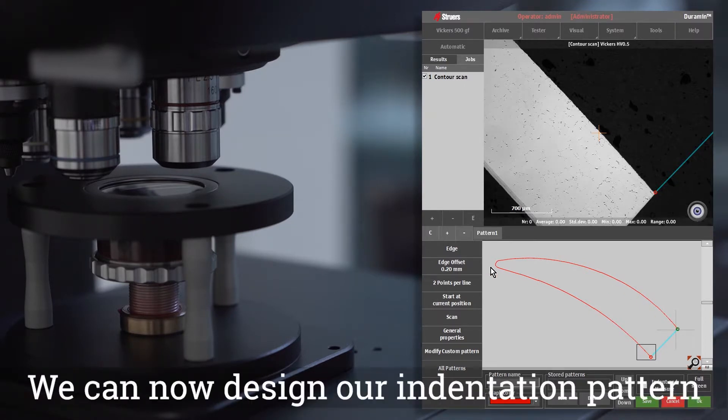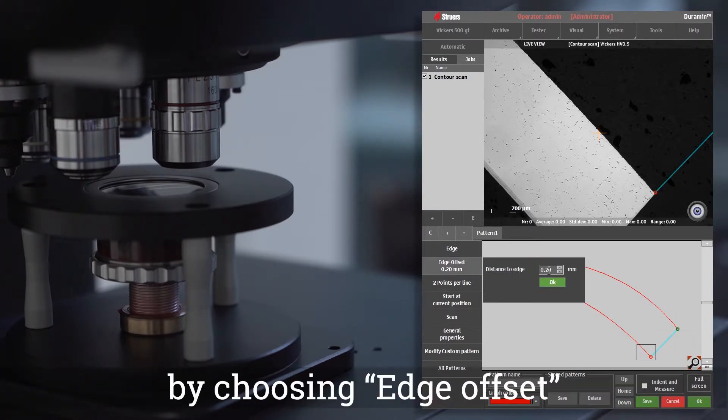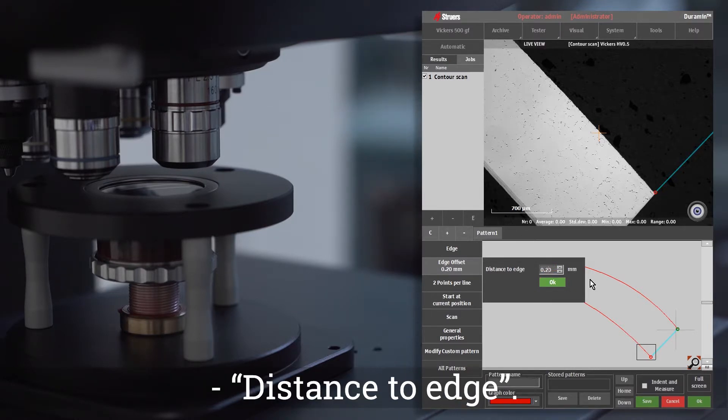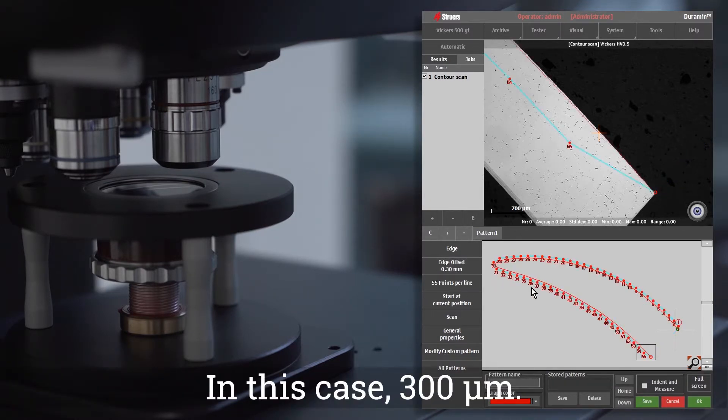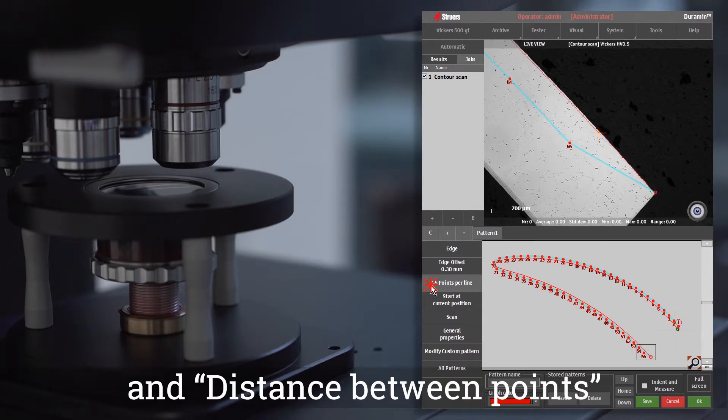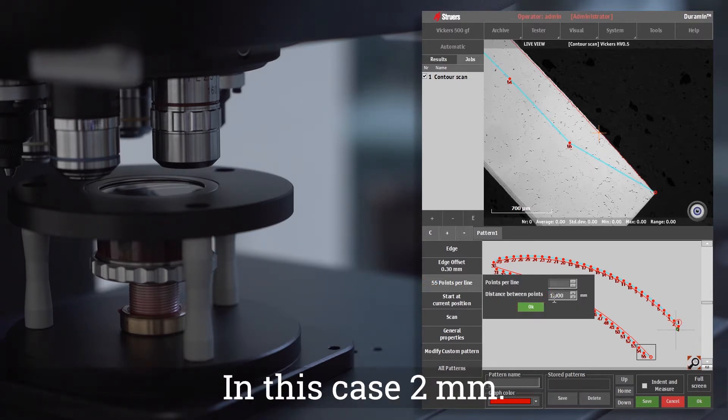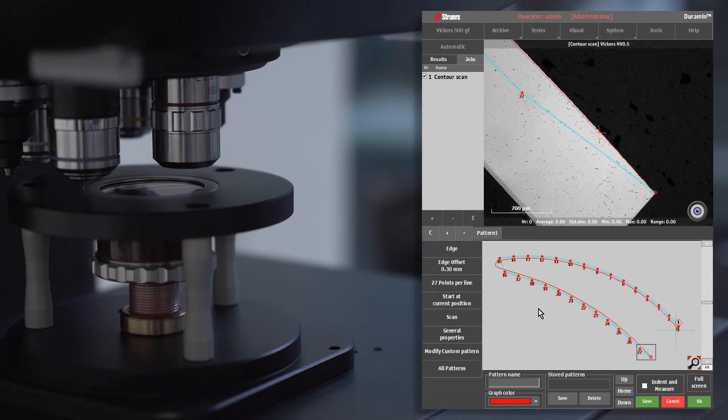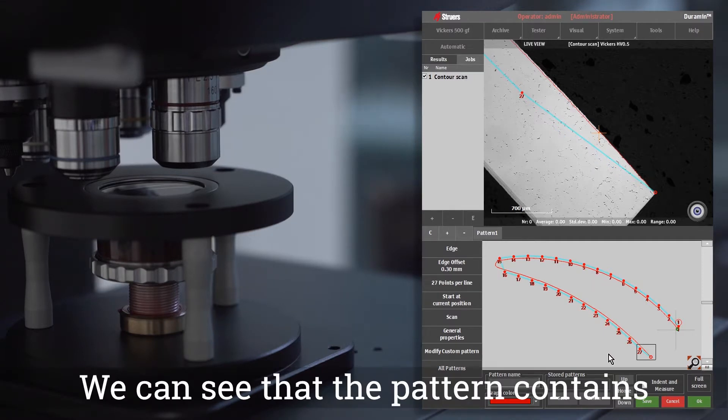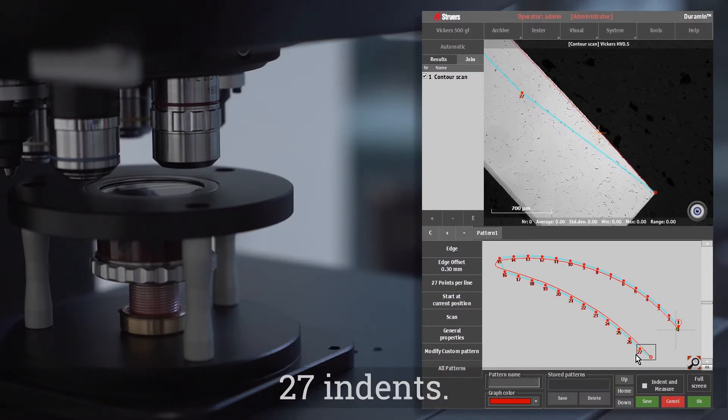We can now design our indentation pattern by choosing edge offset, distance to edge, in this case 300 micron, and distance between points, in this case 2 millimeters. We can see that the pattern contains 27 indents.